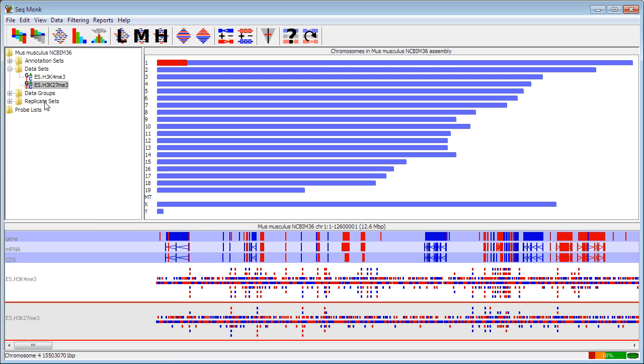If I have biological replicates that are the same biological condition but from different libraries, I can combine them into a replicate set. And it's a good idea to do this right at the start. So in this case I'll just do an example of a replicate set to show these going together, but it's the same idea for both.